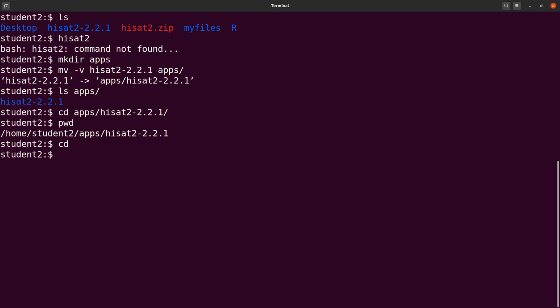And then let's make a backup of the .bashrc file. So I'll say cp .bashrc and then I will put it here. So I'm making a copy and the copy will be given this name. This copy is just a backup. We are not going to use it. It's just a backup so that in case anything goes wrong, we can use that to reverse the changes we made. So I'll copy it. Okay, so do an ls and you see that file also there.